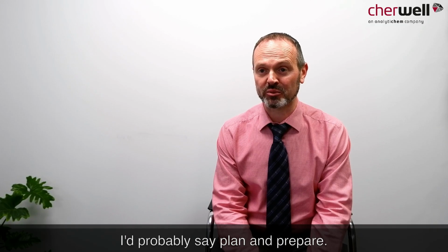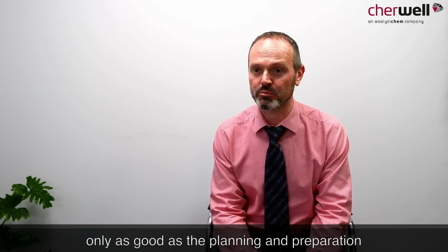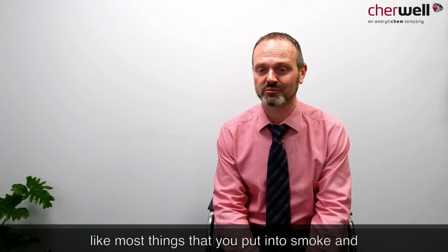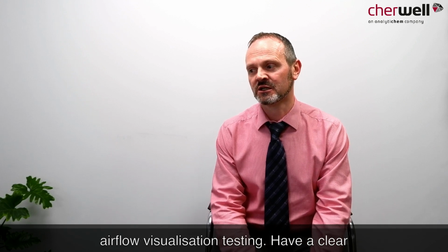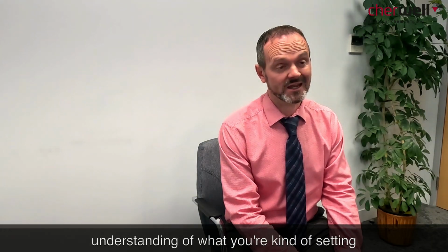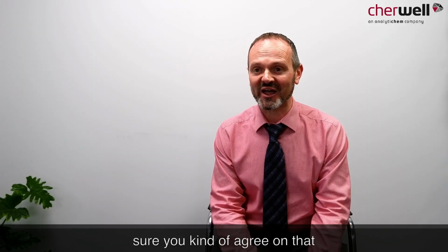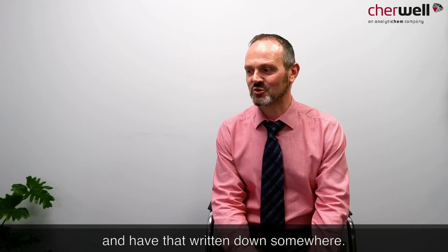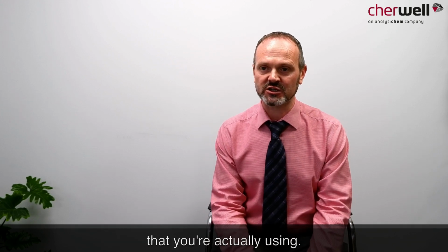I'd probably say plan and prepare. I think I've said that quite often. It's only as good as the planning and preparation, like most things that you put into smoke and airflow visualization testing. Have a clear understanding of what you're setting out to achieve in the first place, and make sure you agree on that and have that written down somewhere. Understand the equipment and the methods that you're actually using.